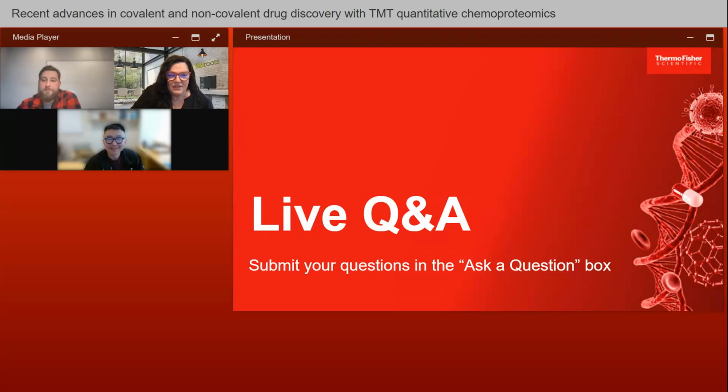My apologies for that. Our next question then: when you see a larger thermal shift in the cell versus lysate, do you attribute that to protein-protein interactions and protein complexes or spatial protein location? And there is a second part to this as well.